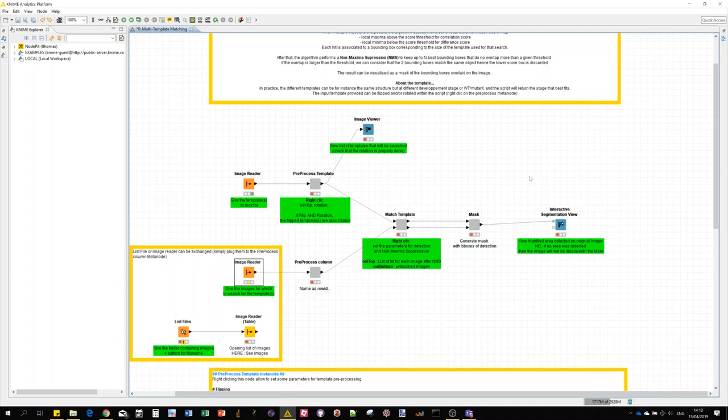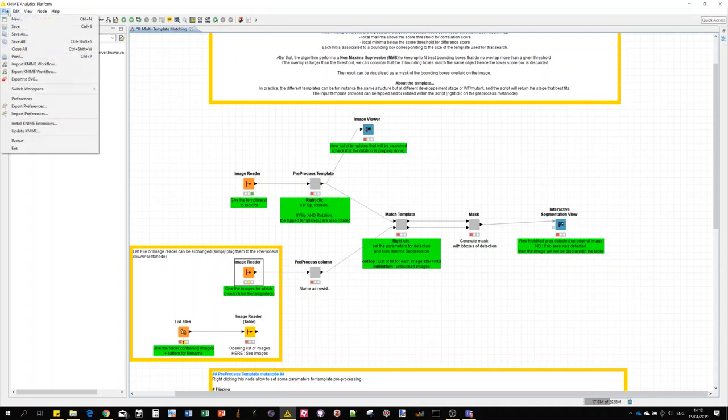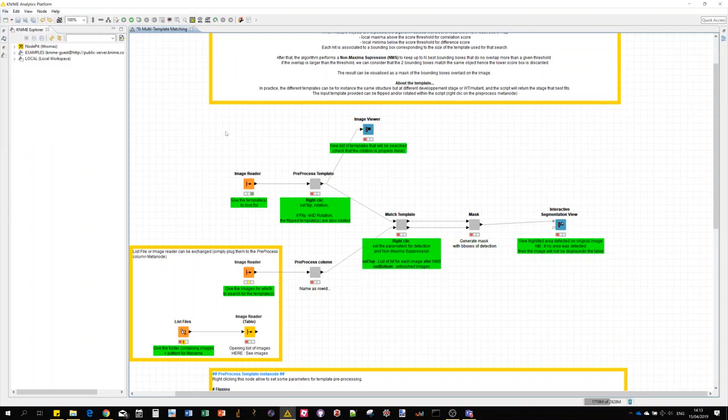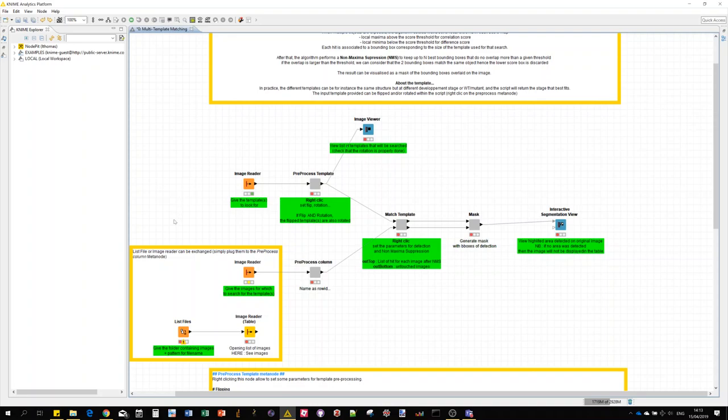Namely the Python integration and the KNIME image processing. For those you just go like usually in File, Install KNIME Extensions. Basically when you open the workflow file, if there is any extension missing, then KNIME will automatically propose to download them.